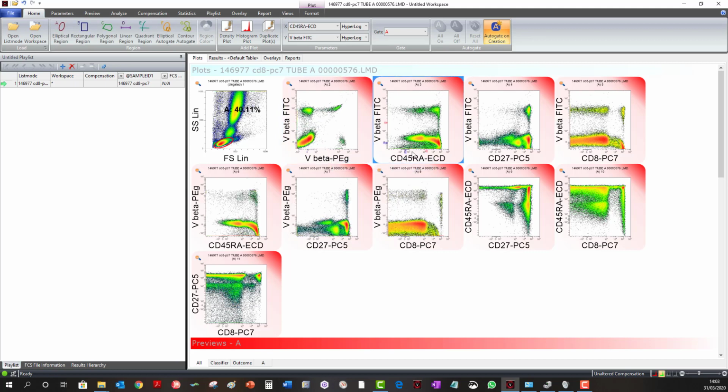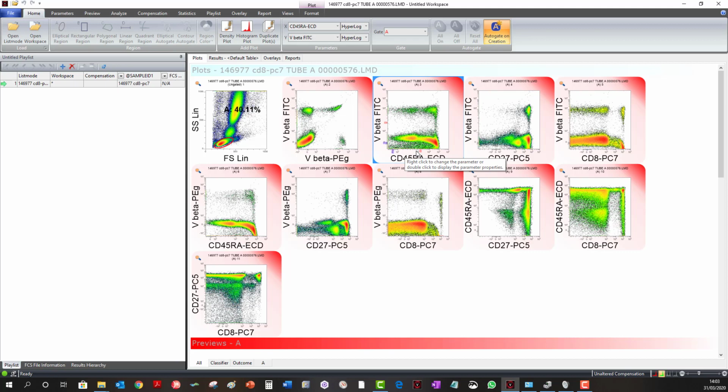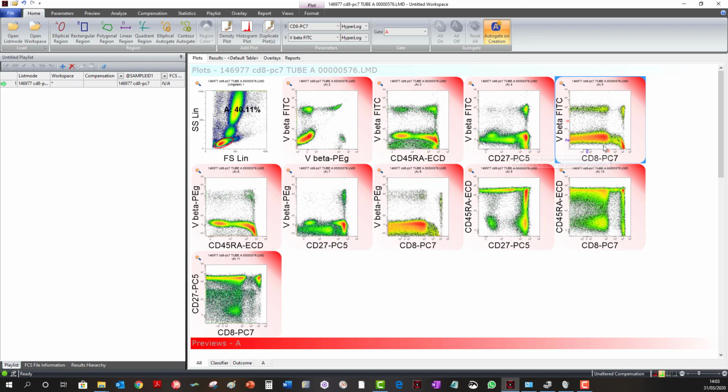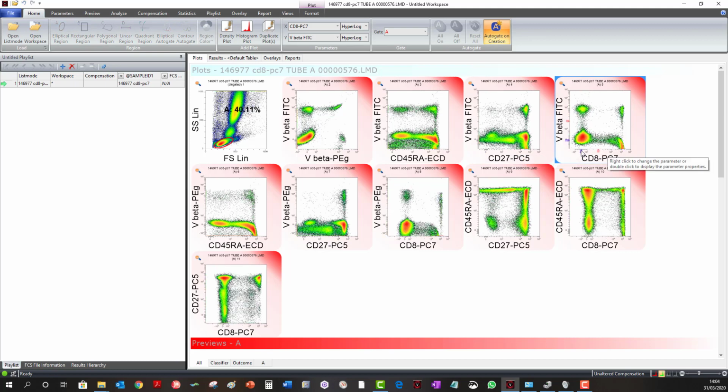So now we'll go to separate plots and straighten up some of the data there so we can actually see exactly what is overcompensated and what isn't. Having adjusted several parameters, it becomes obvious that there are several populations that are overcompensated.